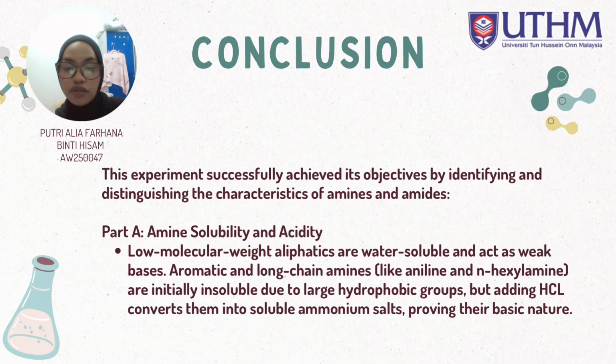For this experiment, we successfully achieved its objective by identifying and distinguishing the characteristics of amines and amides. For part A, amine solubility and acidity: low molecular weight aliphatics are water soluble and act as weak bases. Aromatic and long chain amines like aniline and N-hexylamine are initially insoluble due to large hydrophobic groups. Adding HCl converts them into soluble ammonium salt, proving their basic nature.